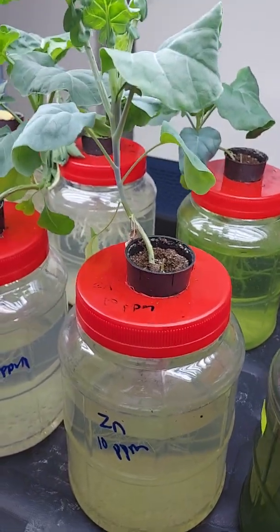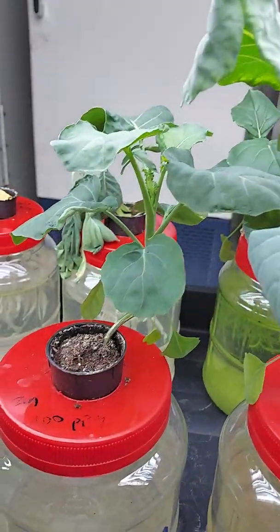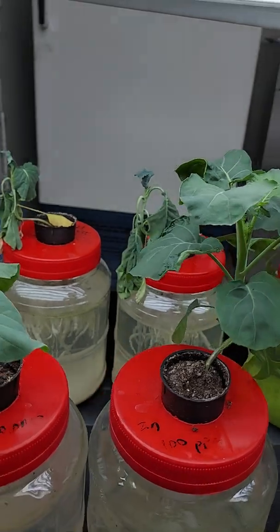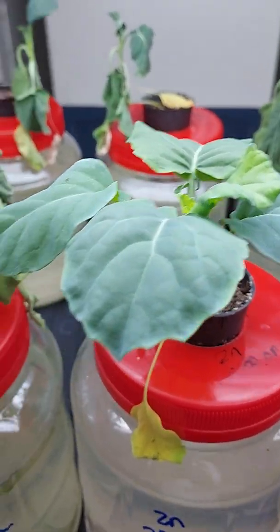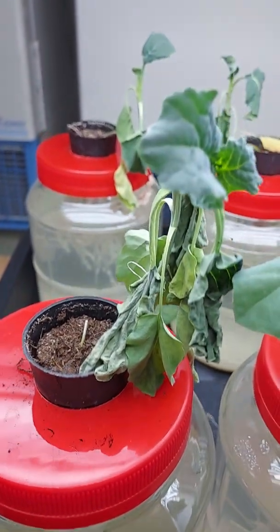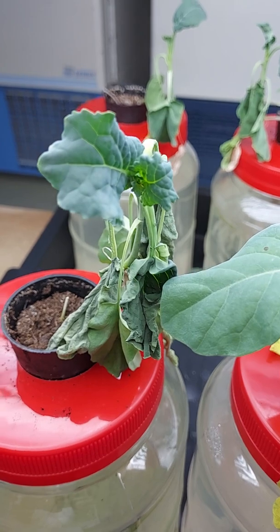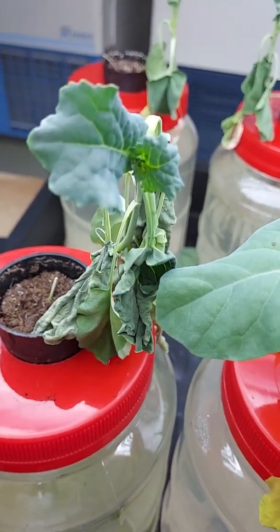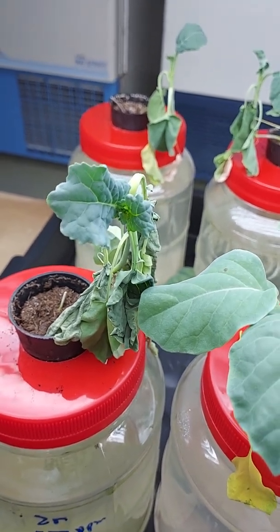Zinc at 10 ppm, there was almost no change in the morphology. At 100 ppm, again no change in morphology. At 200 ppm, there was a slight deterioration of the leaves. And at 500 ppm, of course, the plant is under extreme stress, and only the apical leaves appear to be tolerant to the stress. Now this is after a week of exposure to the metal ion.